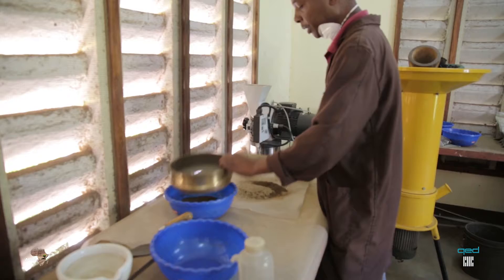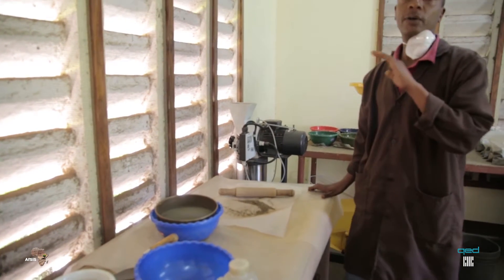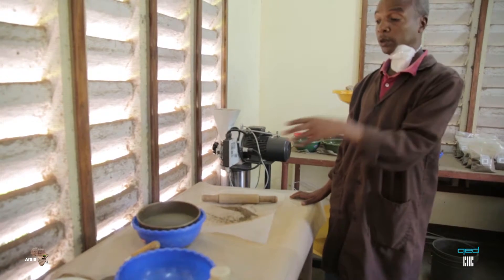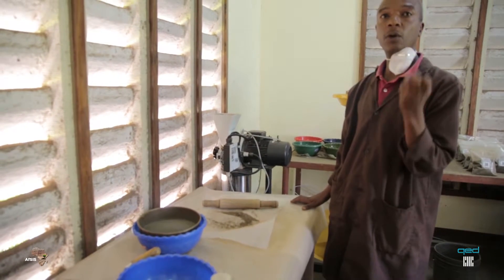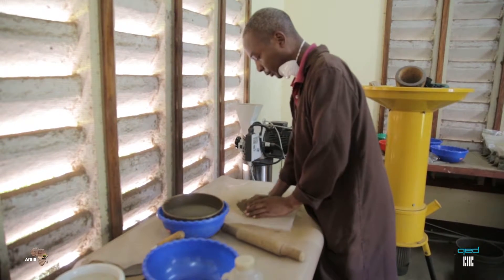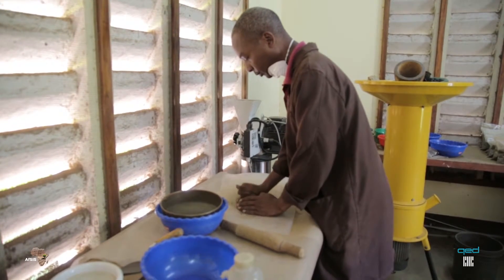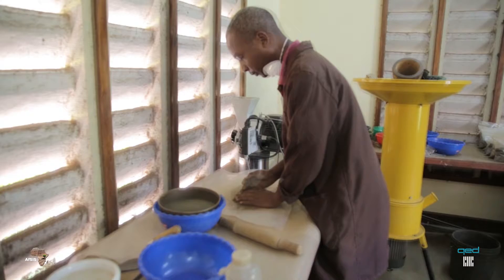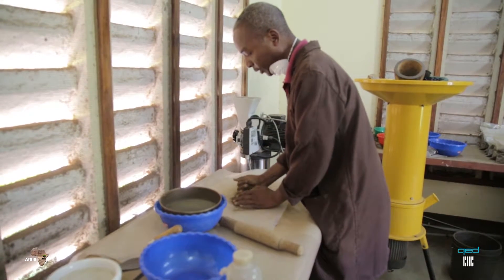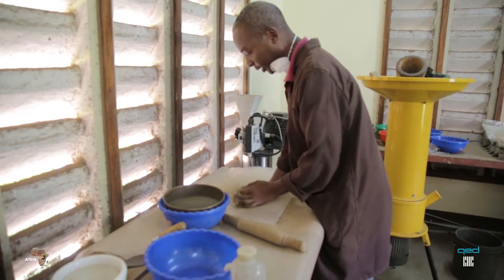Then you grind it again until you make sure that all the fine soil has already been crushed, and what is remaining on top of the sieve mesh is just the coarse rocks only. Sometimes you can use your hand to scratch it so that you can get a pure coarse fragment or rocks.